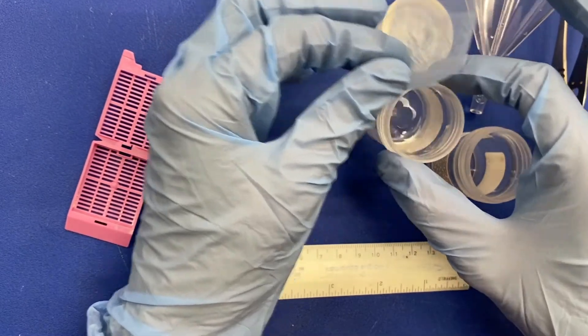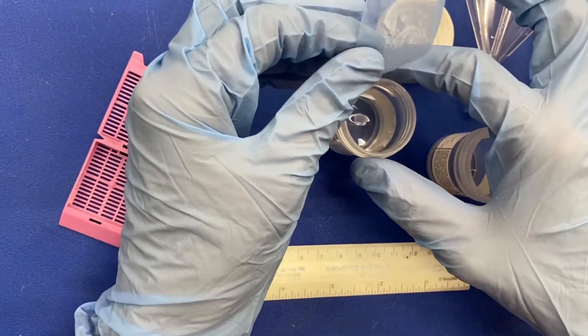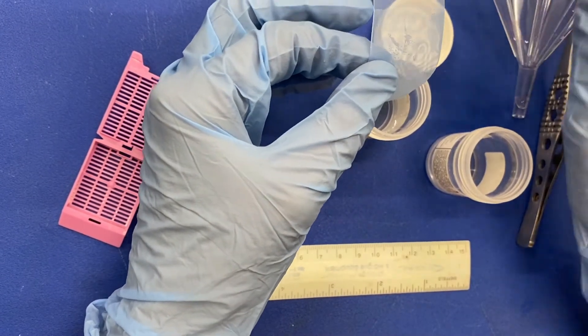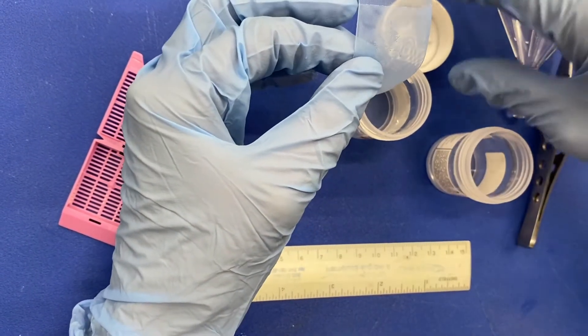From there, you may recycle the formalin at your institution or, at some places, discard it in the sink under running water. Follow your institution protocol.